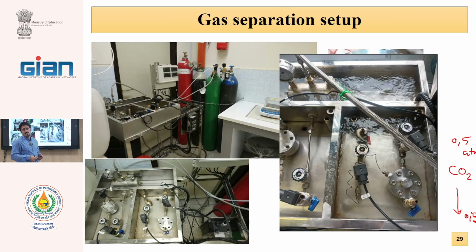We can calculate solubility and diffusion. In this system, we measure permeability and the solubility coefficient, and from the solubility and the permeability, we can calculate the diffusivity coefficient. Okay? Therefore, we calculate both the solubility and diffusion coefficients.